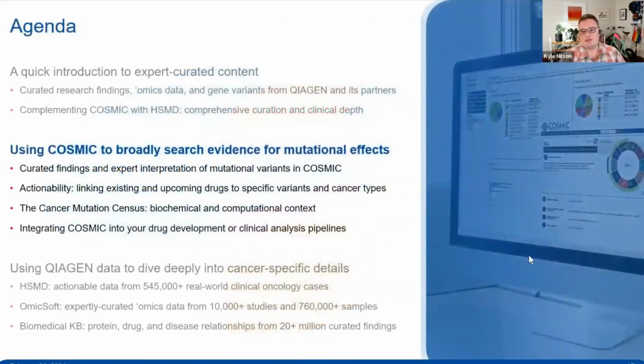So for this initial use case, I want to go ahead and show you how you can take advantage of COSMIC to broadly search for any kind of evidence of mutational effects.